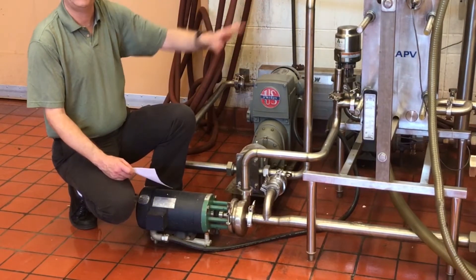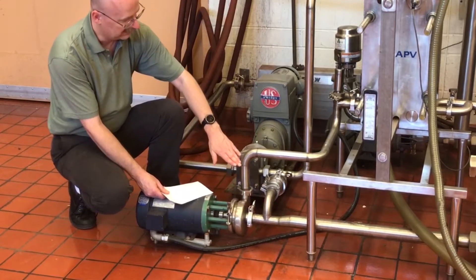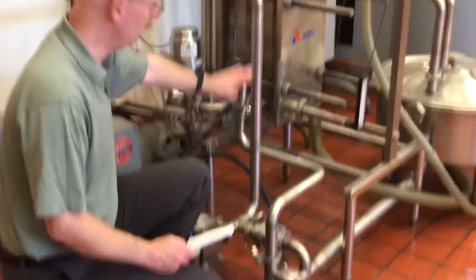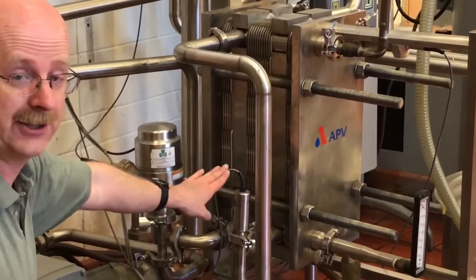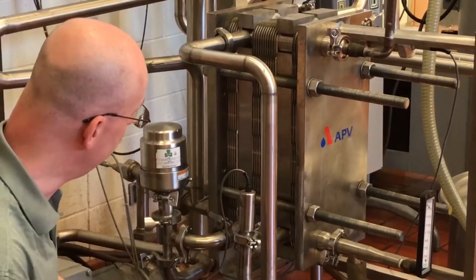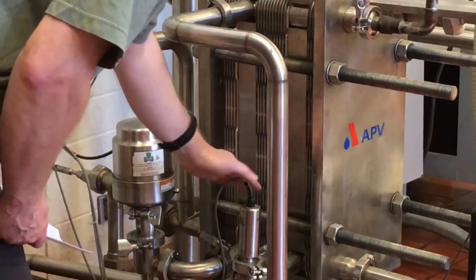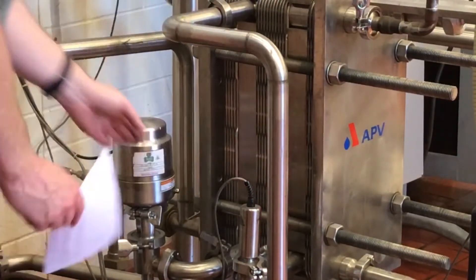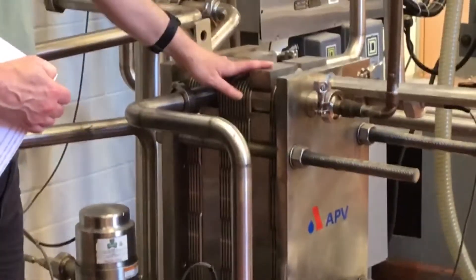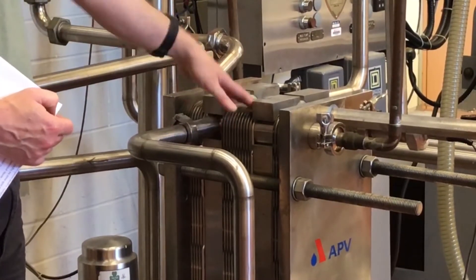Once we have our plate heat exchanger fully functioning, the milk flow goes into our plate heat exchanger. There are a number of controllers and sensors that are going to be taking temperatures and pressures throughout the system. The first sensor here is measuring our inlet pressure — the raw pressure — as the raw milk comes in and enters the first section, which is known as the regeneration section of our plate heat exchanger.